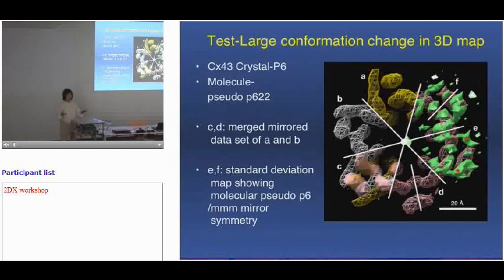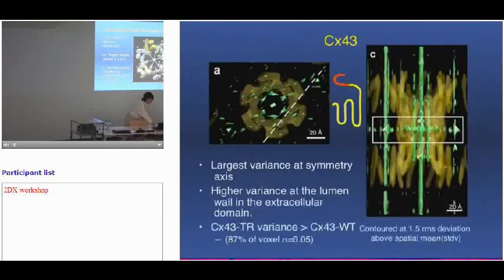While I'm doing all this bootstrap resampling to estimate my variance, or when I'm calculating density, it never actually used this symmetry. So my expectation is that if I'm doing this right, when I finish my bootstrap resampling, my variance map should have the same kind of symmetry. So indeed, once I get it out, it does have the same symmetry. Also the location of the major peaks corresponds to the major differences between the 2 mirrored maps. So that confirms that this method works.